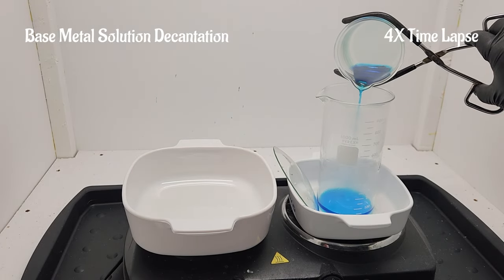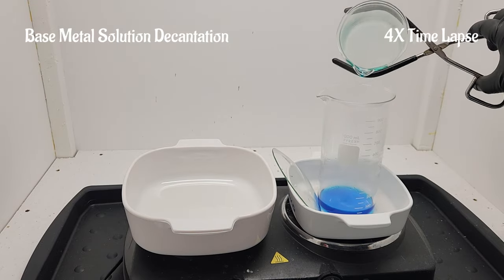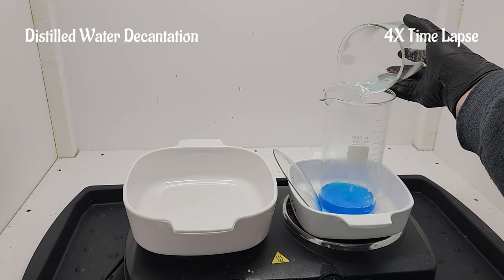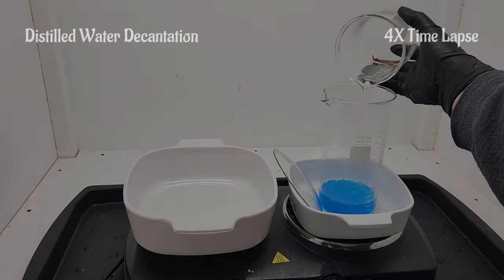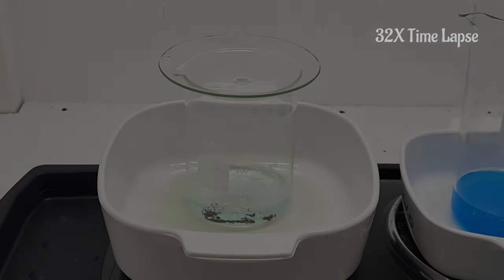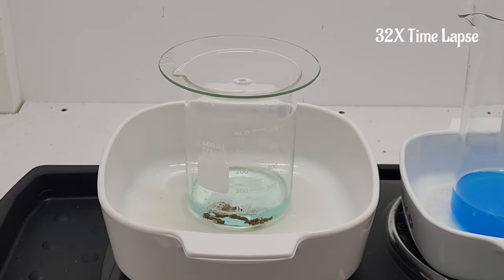After approximately 3 hours, nitrogen dioxide gas production ceases, and the reaction is complete. We decant our base metal bearing solution into a beaker and rinse our gold using distilled water. A second refining using the same amount of distilled water and concentrated nitric acid is required to ensure complete base metal removal. There should be very little reaction, as most have been removed.